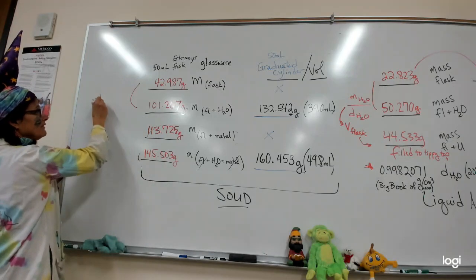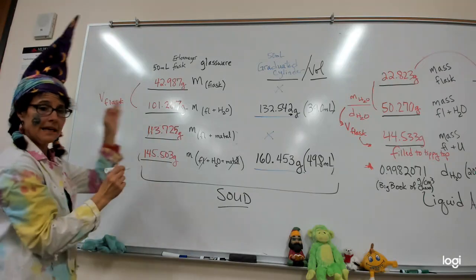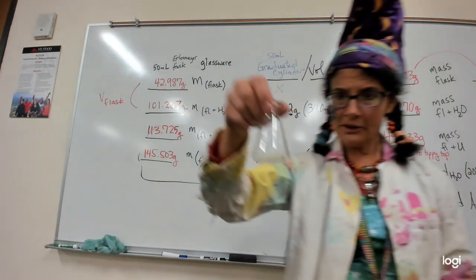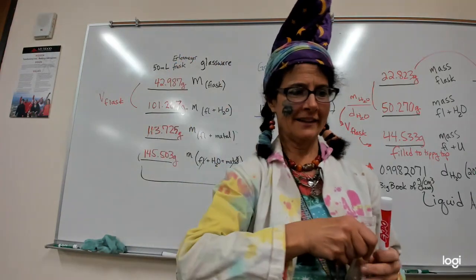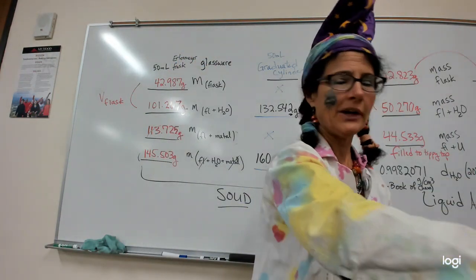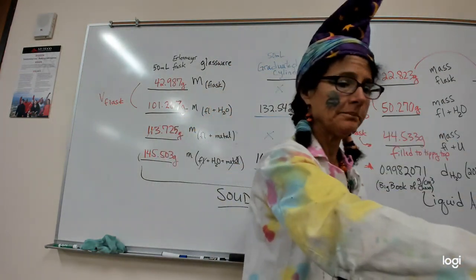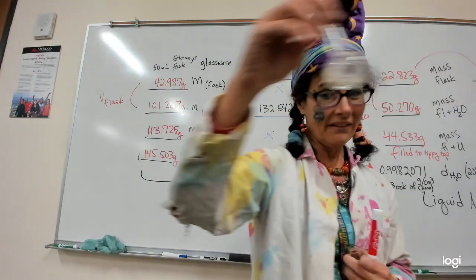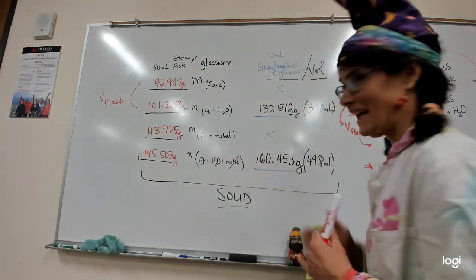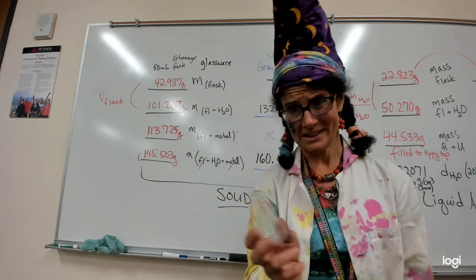here is how we can find the volume of our flask. This time it was a 50 milliliter Erlenmeyer flask. So here's my Erlenmeyer flask. This was a volumetric flask. They have a different shape. And this is a graduated cylinder. So a graduated cylinder can read all sorts of volumes. Somebody knows how to read it. A volumetric flask only reads one volume, unless we fill it all the way up. In an Erlenmeyer flask, it's really imprecise.